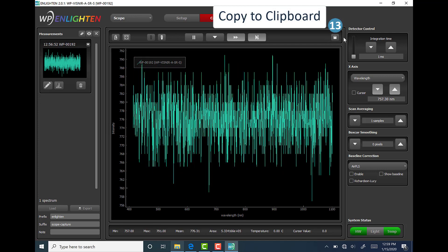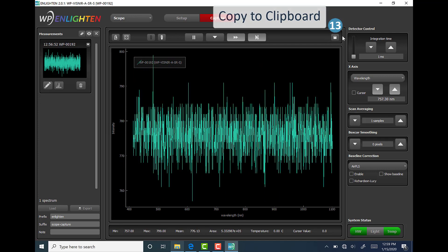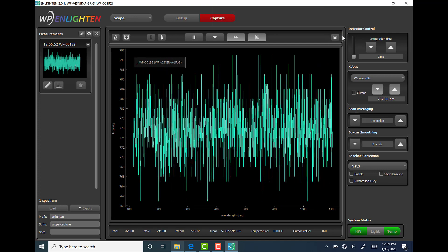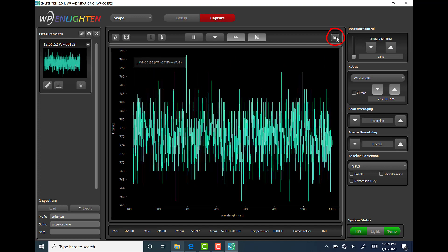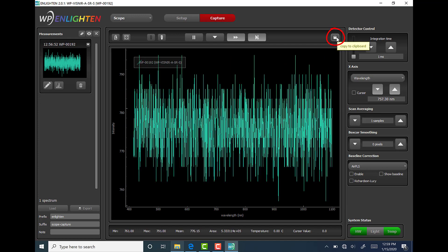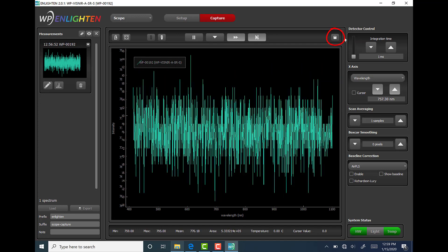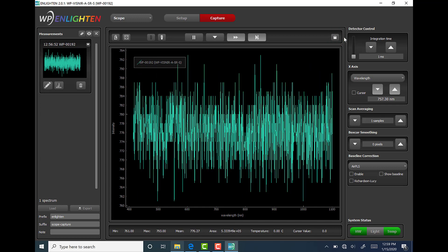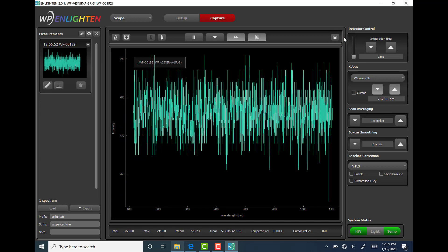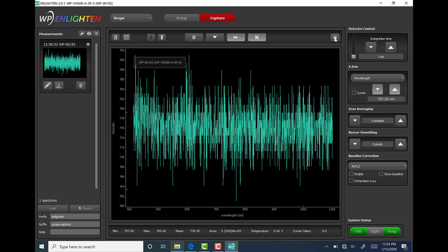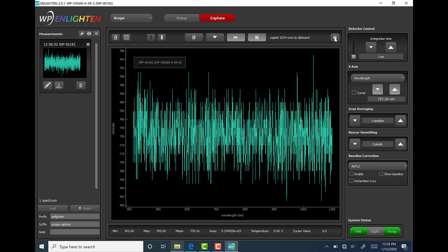Moving just to the right of the status message area, we find the copy to clipboard button. This allows the user to quickly copy the currently displayed spectra and x-axis to the system clipboard for pasting into other applications functions such as Microsoft Excel.